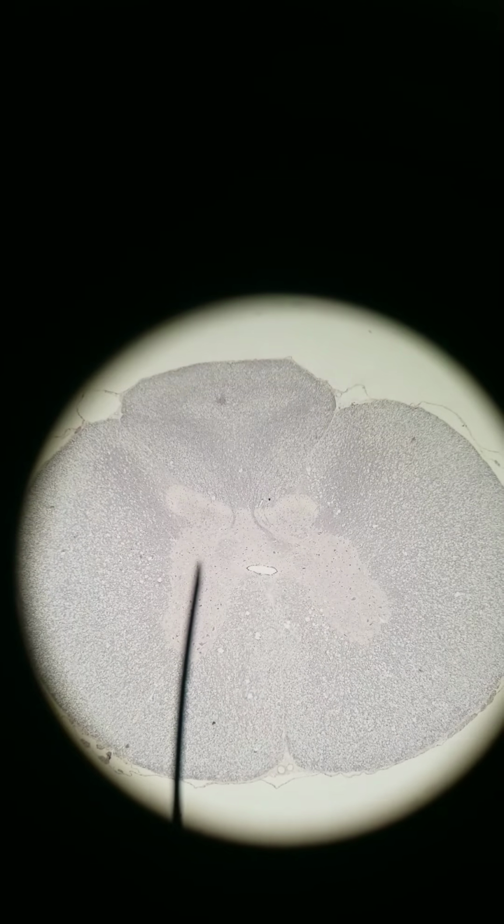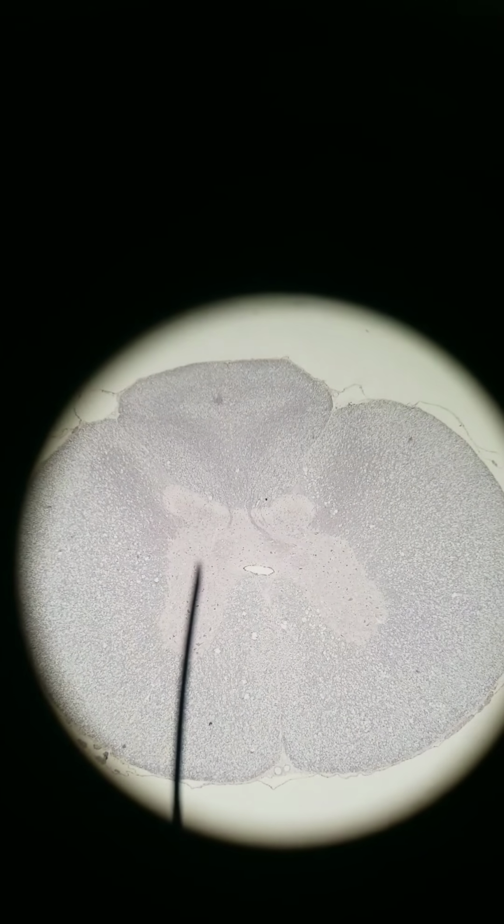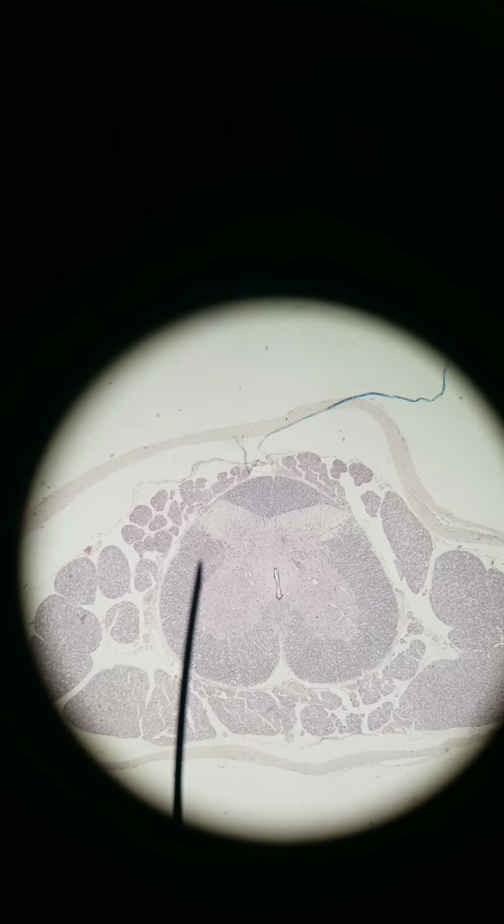The thoracic level, you don't have as many neurons coming in or out, so it's a bit smaller. Going to lumbar, it gets bigger again because you've got your legs to worry about. And then sacral gets really small because now we're just getting to little parts like the genitalia or our groin area, inguinal area.